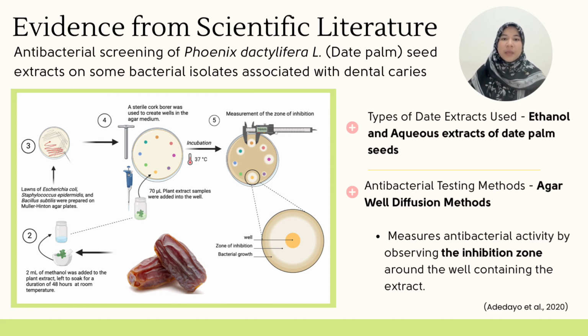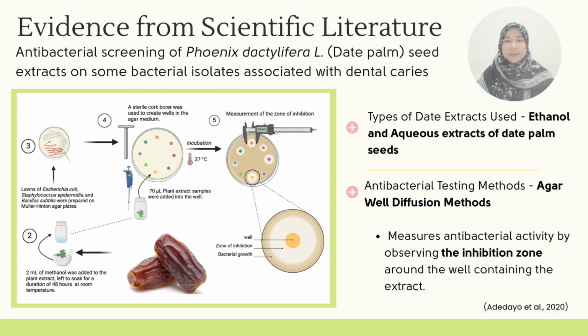The researchers prepared two date extracts, which are aqueous extracts and ethanolic extracts. The antibacterial testing method used is the agar well diffusion test, which measures antibacterial activity by observing the inhibition zone around the well containing the extract. Larger inhibition zones indicate stronger antibacterial activity.